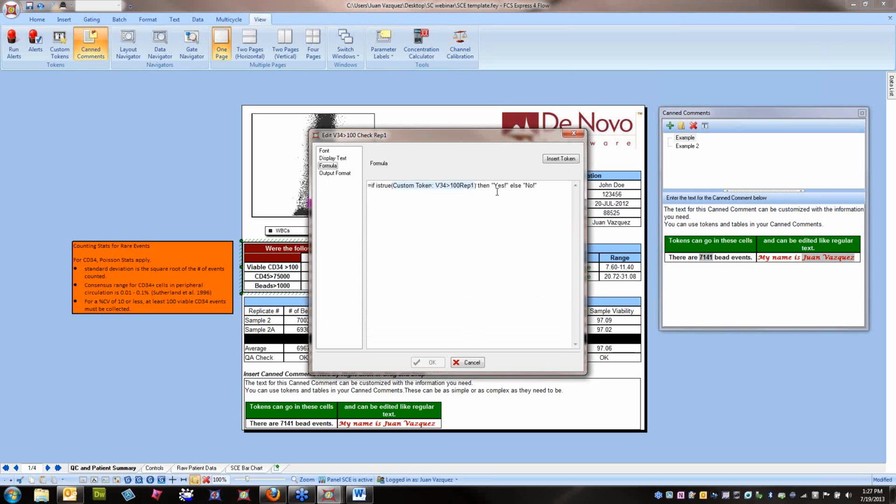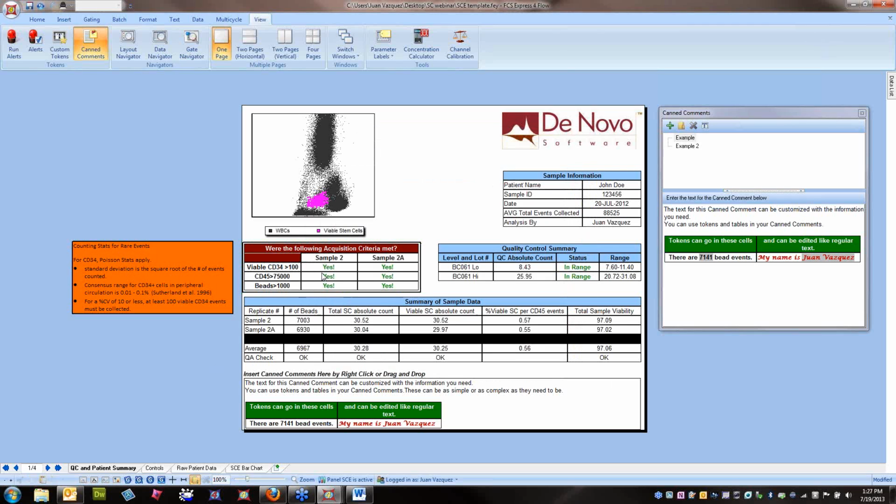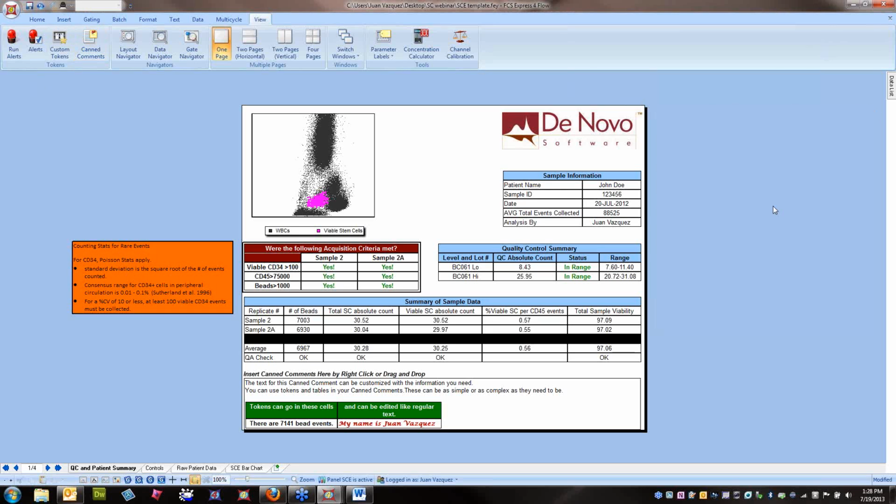If not, no. I've done that as a safeguard to make sure that my overall assay is as precise as possible. These types of analyses that you can perform within your assay are very critical in this type of rare event analysis, so there's a lot of value in that, and the idea that this can be reproducible should underlie that concept.